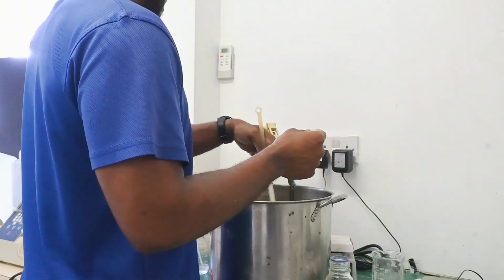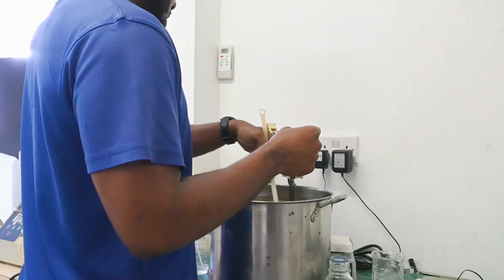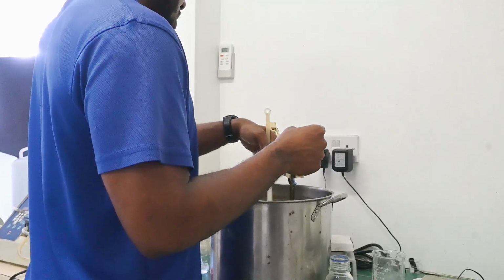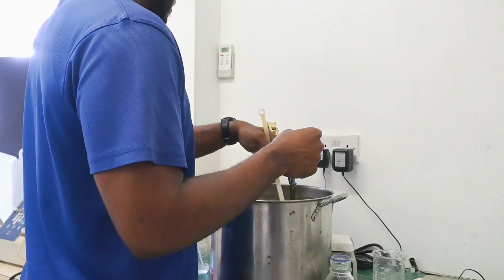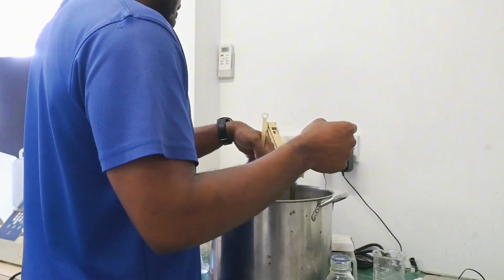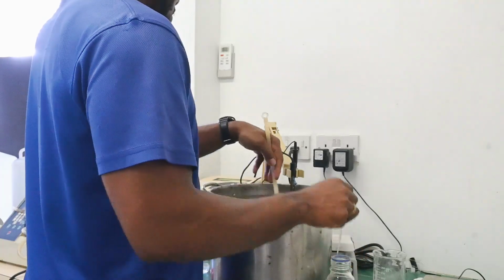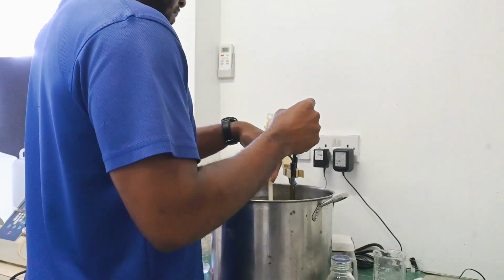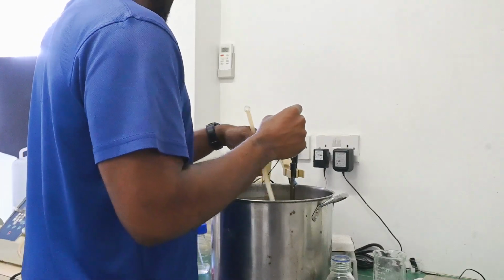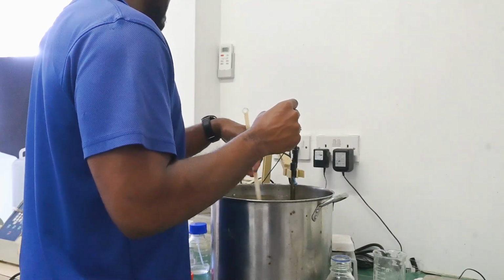It will go up because while the hydrochloric acid is becoming more uniform within the media, the level will not stay the same. That's the purpose of always stirring it, to try and ensure the uniformity, so you will know the reading is more accurate. So the reading has gone up from the 5.7 to 5.73. So that means you still have to add more hydrochloric acid to get it down to the level it needs to be. So now I'll add drops to try and bring it down as much as possible so it doesn't go below the 5.7.